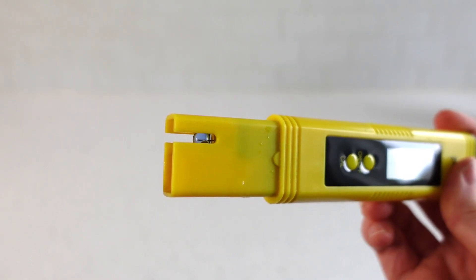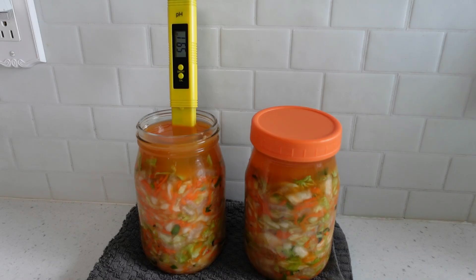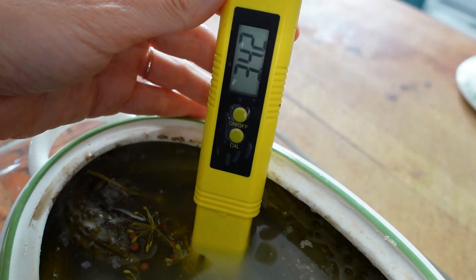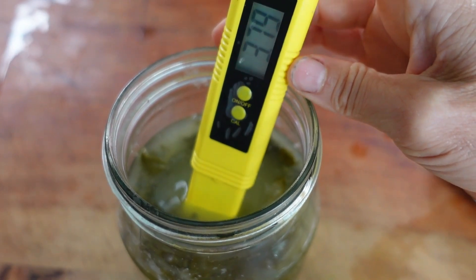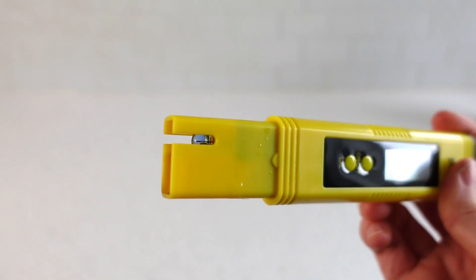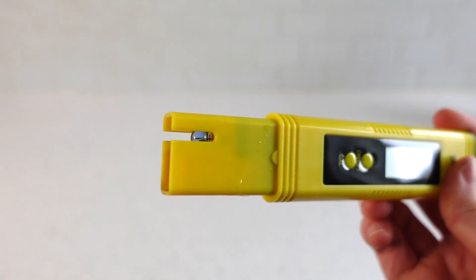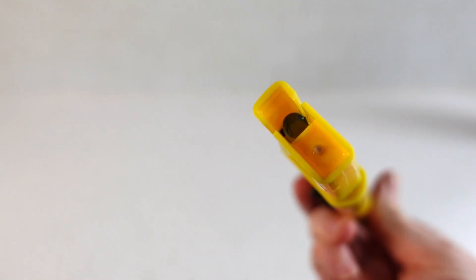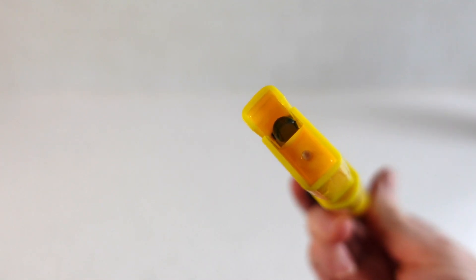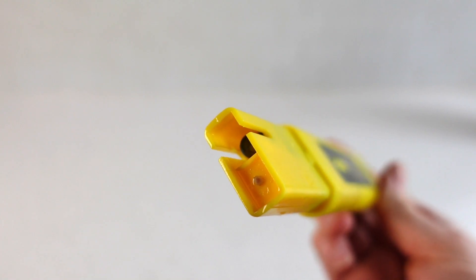The basic meter can be used with liquid, so it is perfect for testing the brine of a vegetable fermentation, kombucha, vinegar, and other fermented beverages like homemade fermented sodas and milk. The probe of the basic pH meter is tucked in a protective shell because the probe is incredibly delicate. If it comes in contact with anything other than pure liquid, it will cause the meter readings to malfunction and become sporadic. Once the meter goes wonky, a new meter will need to be purchased — I speak from experience.